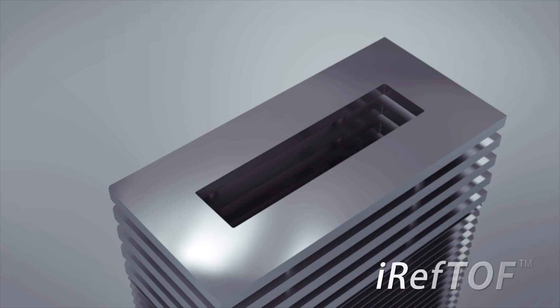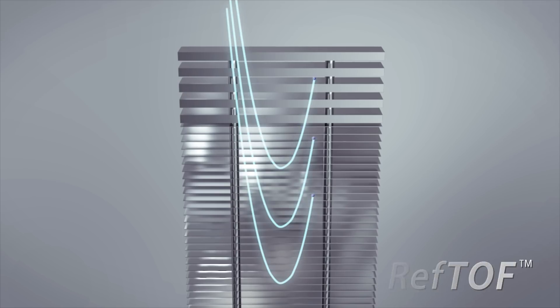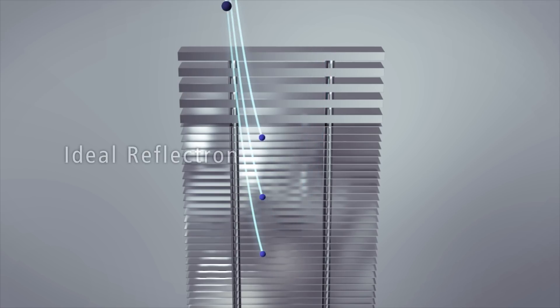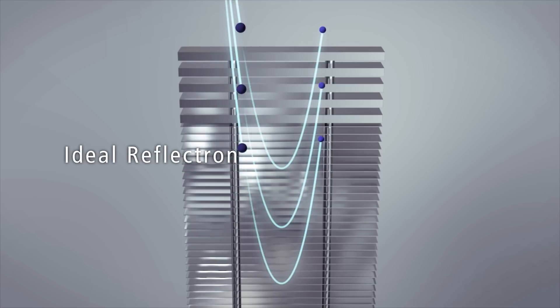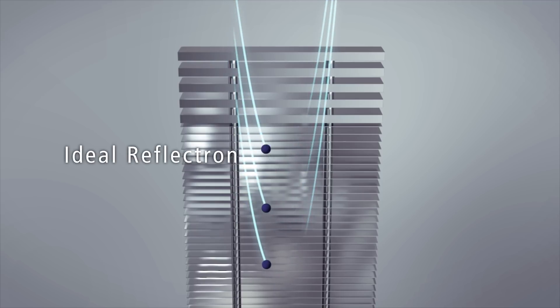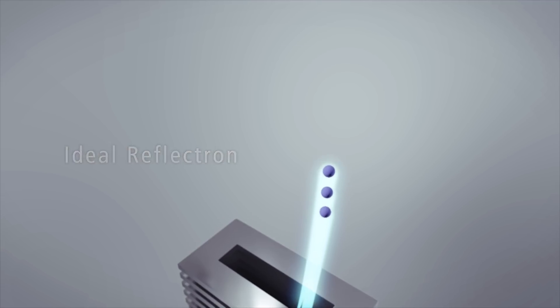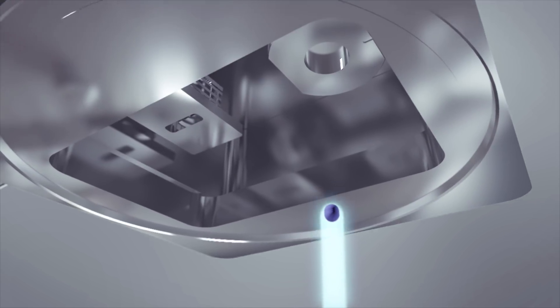In the UF flight tube, IREFTOF, with its unique electrode arrangement, delivers the ideal reflectron field to correct ion trajectories into a singular focal point for maximum mass resolution.